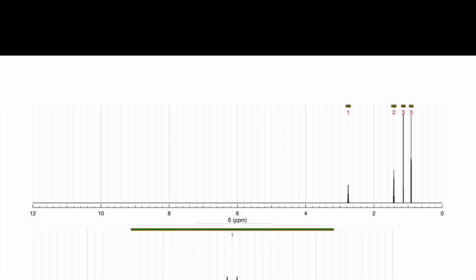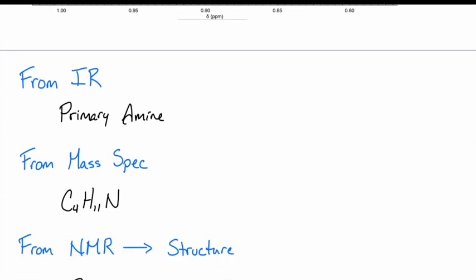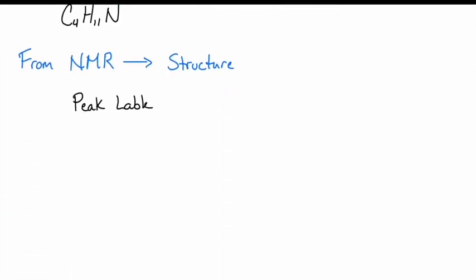So this one right here is peak A, peak B, peak C, and peak D. I want them in that order. All right. I don't want anybody's peak A to be this one and B this one. That makes my life more miserable grading wise. All right. So keep them consistent. We're just going to letter from left to right. So that's my peak label. And then I'm going to put my chemical shift. Right? Where on that x-axis is that peak located?